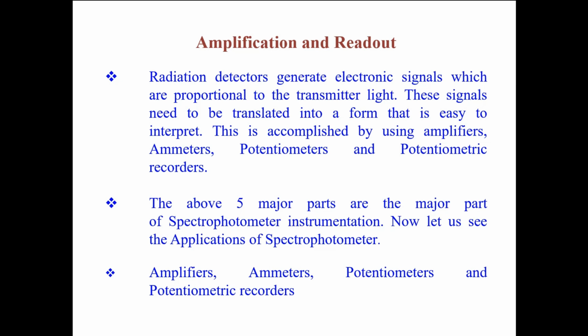Okay, then the monochromatic light which is coming out from the monochromator will be passed through the sample. The samples will be placed in a sample holder, which we call cuvettes, and there are different types of cuvettes, like you can use evacuated glass tubes as sample holders for the gases. Whereas UV light can also be absorbed by the glass, so that's why we can't use glass for the UV range. Whereas for the visible region, you can use normal glass.